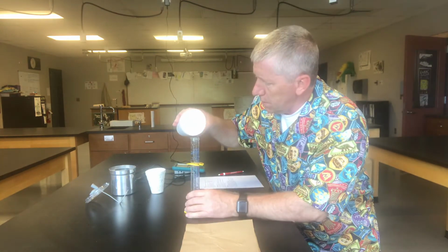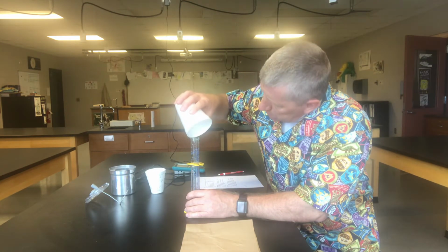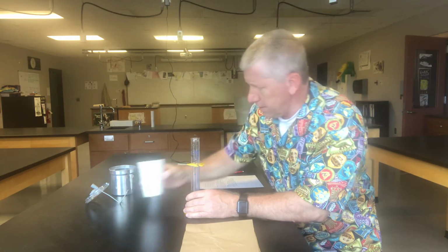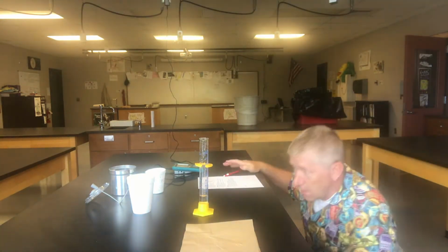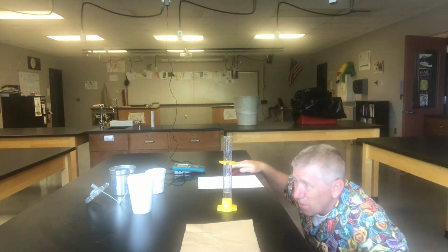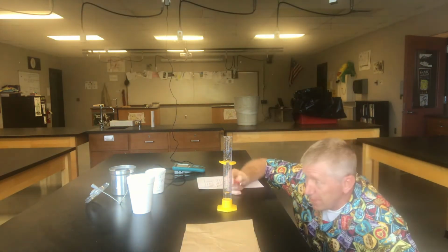Okay, let's pour the rest of the water into the graduated cylinder carefully. Don't screw it up now. Okay, shake, shake, shake. And once again, shake your booty. All right, dump that all in. Let's read. Get down to eye level. I don't know if I can get back up. I'm getting too old for this. Eyes as well, not as good as they used to be. Not as good as yours, lab partner.